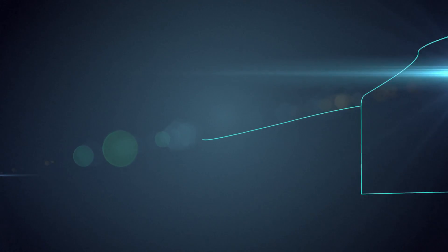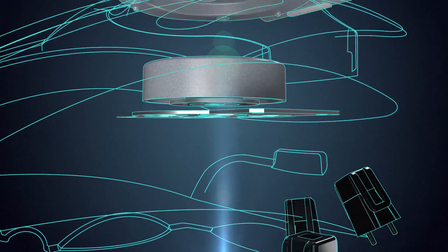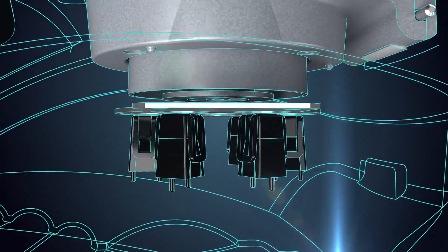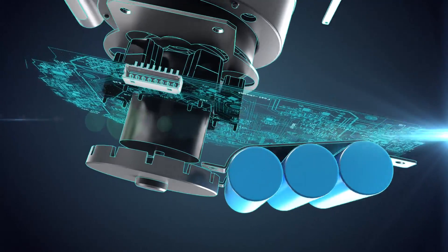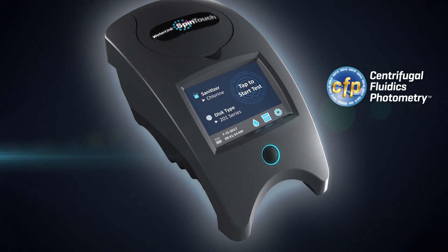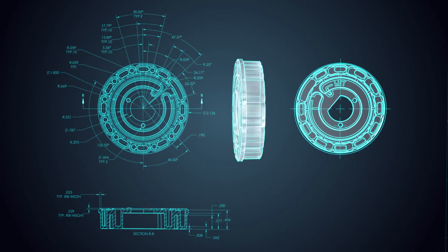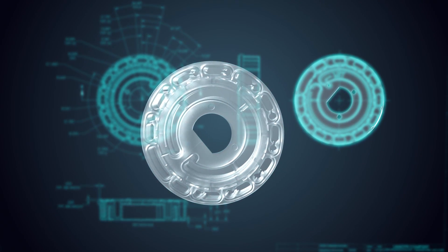Every now and then a technology emerges that changes people's lives. For people who test water, that time is now. Proven analytical chemistry has combined with centrifugal fluidic photometry to create the breakthrough WaterLink Spin Touch. The genius is its reagent disk that simultaneously tests 10 parameters.